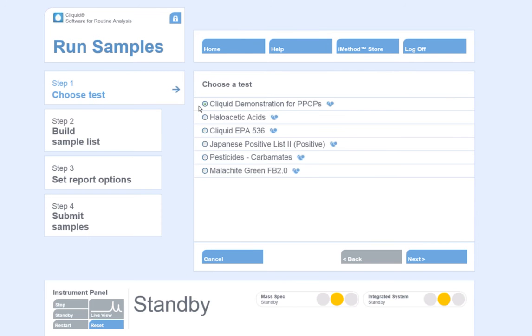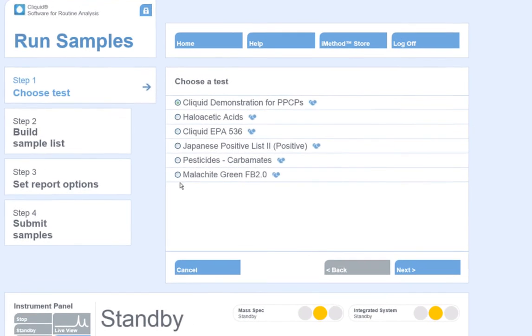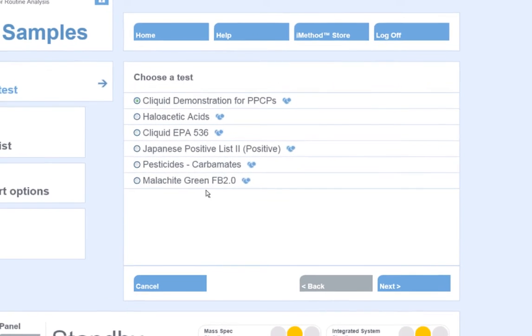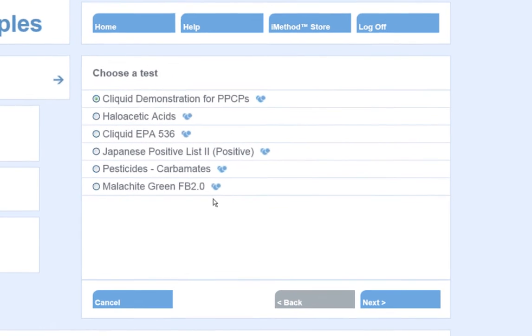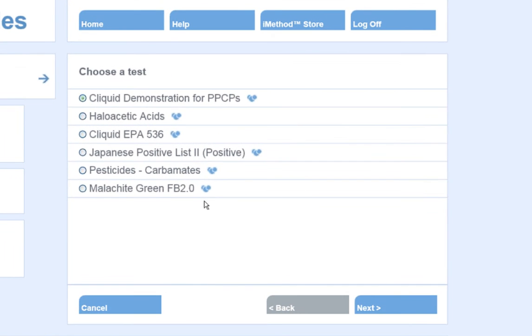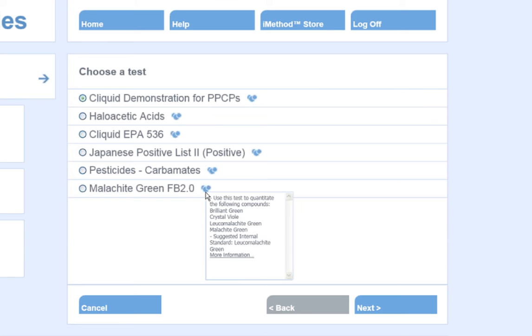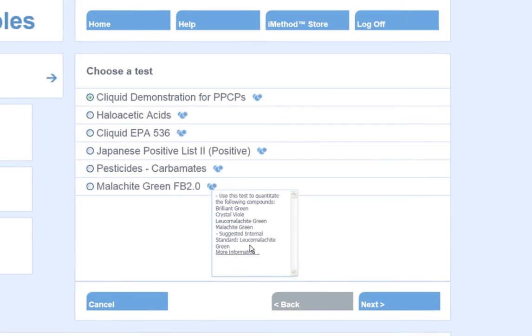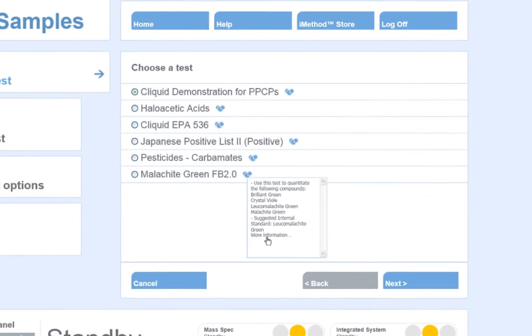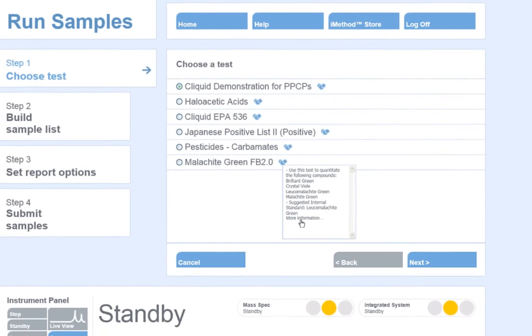The software knows what tests are available and displays them on the right-hand side of the screen. If more information is required about a test, click the icon of the molecule to the right of the test's name. This gives a method description as well as a link to the method SOP.